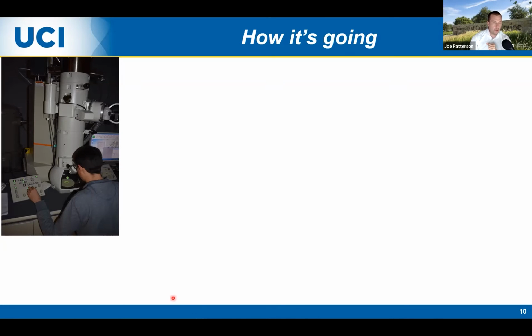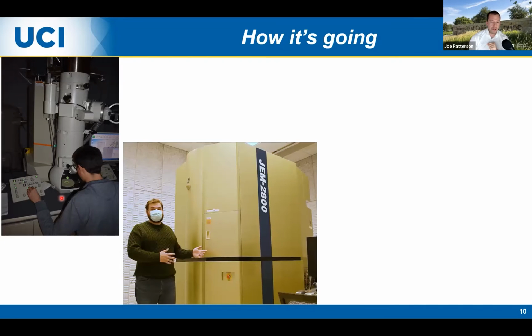And here you can see Paul, one of my graduate students. He's working at the TEM. These are very complicated instruments. They cost millions of dollars. And it's often very intimidating for students when you first start to use these because you're very afraid about breaking them, particularly for chemists, actually, because it's something we're often not taught about a lot in our undergraduate degrees.